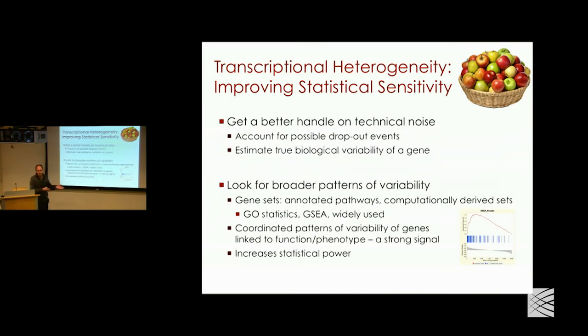In practical terms, you could take something like gene ontology and treat GO categories as gene sets. You could derive gene sets in other ways. For instance, we've done this looking at brain: we went to the Allen Brain Atlas database and derived clusters of spatially correlated genes. It's expression, but somewhat unrelated to the exact thing. And it turns out these genes do correspond to functions that happen in the brain in a coordinated manner, and giving such gene sets will also be very informative. You can derive them in a variety of ways, including custom literature-derived sets, and we don't put restrictions on that.